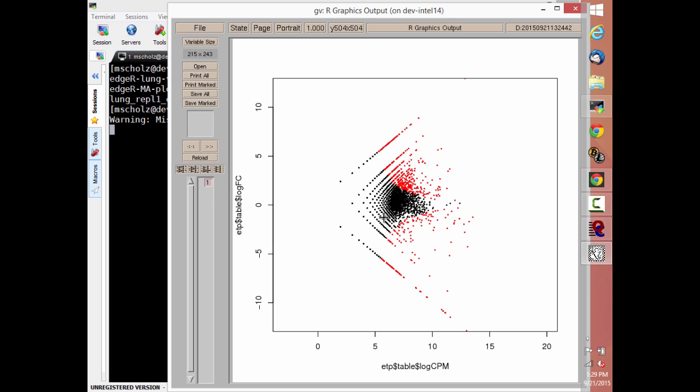So what we're looking at is a chart that is, for all useful purposes, showing us on the y axis whether a gene is up or down regulated, and on the x-axis how highly expressed that gene is at all. So what the average number of counts for that gene is overall. So the farther this way you go, the more reads there are associated with any given gene in this pool. The red and black coloring is a filter that was put in place to find genes that EdgeR believes are significantly differentially regulated given a cutoff of the FDR. So we're looking for a false discovery rate below, say, 0.05. What do we find?